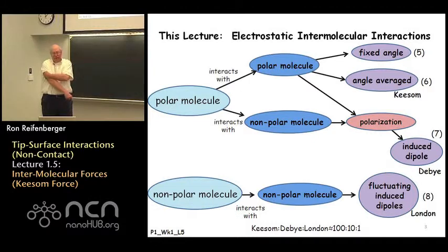In this particular lecture, it's going to just get more complicated because now we're going to start to consider how molecules interact with other molecules. We're no longer concerned with ions interacting with molecules. We're more interested now in polar molecules interacting with polar and nonpolar molecules. This will give rise to something called the Keesom and Debye forces, and those two forces will be derived in this particular lecture.